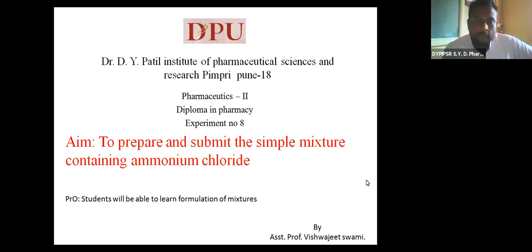Today we are going to study experiment number 8 from Pharmaceutics II for Diploma in Pharmacy. The aim of the experiment is to prepare and submit the simple mixture containing ammonium chloride. From this experiment, students will learn how to prepare and formulate mixtures, that is, how to manufacture mixtures containing active constituents, or mixtures containing the API, that is, active pharmaceutical ingredients. So let us start the experiment.